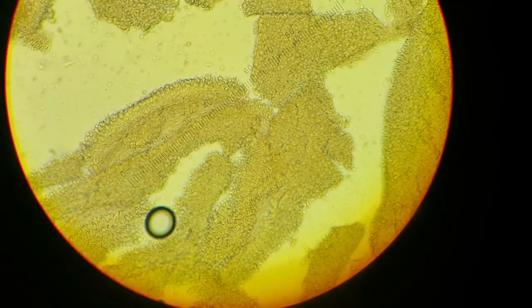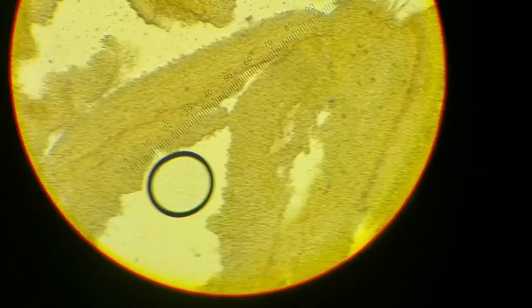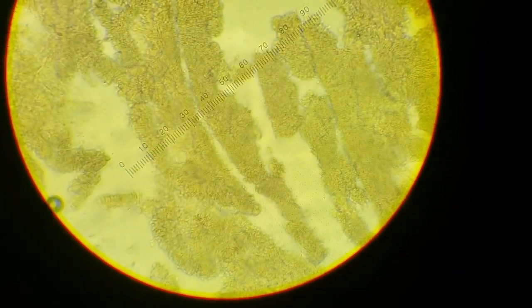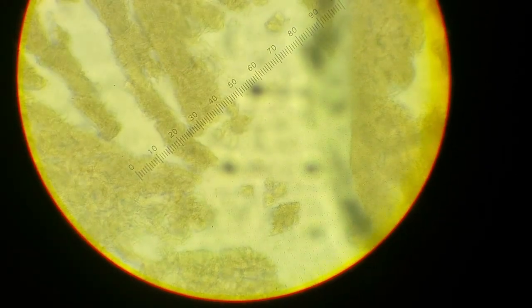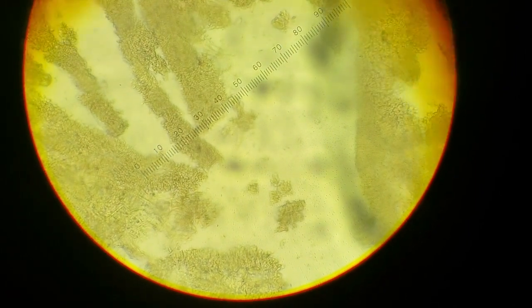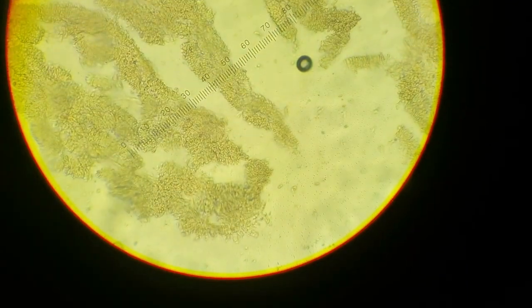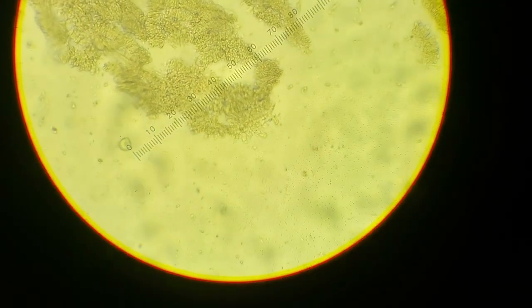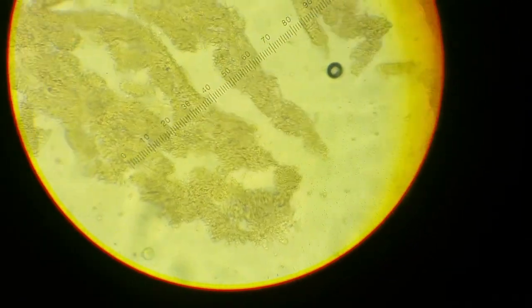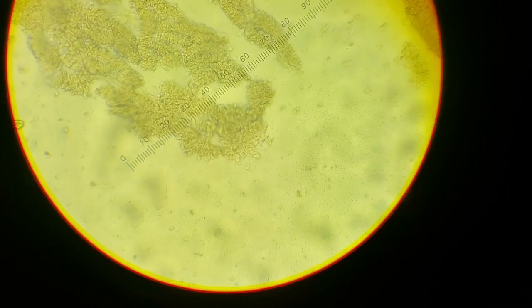Focusing. Yeah, this is still very much intact. You still have a sense that you're looking at a gill, but maybe here is a little better, more destroyed. This could be, it's blurry because this has oil immersion, but I'm on the lowest magnification, so I'm nowhere near the droplet, but it's probably making it a little blurry. So what I'm going to do is zoom in onto this portion here, because I feel like structures were separated from each other best here. And then let's see what we get.